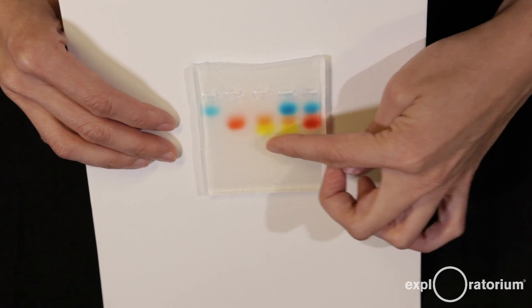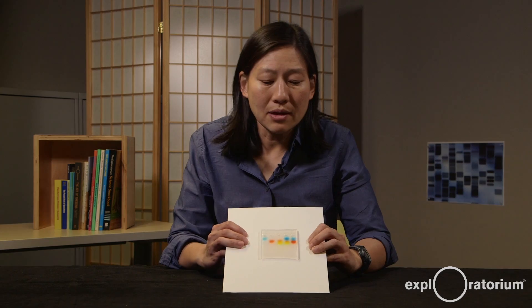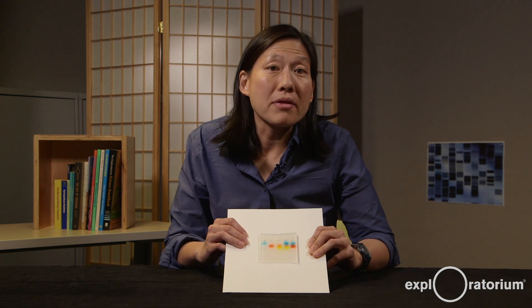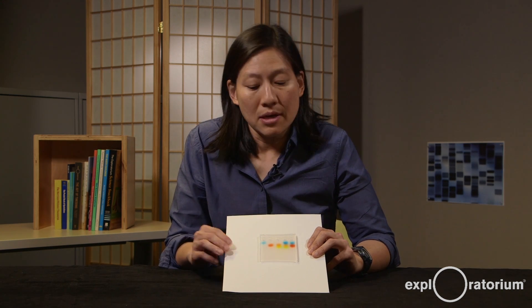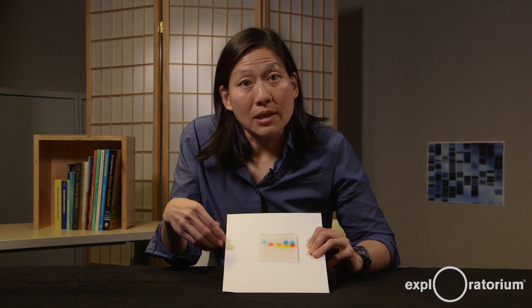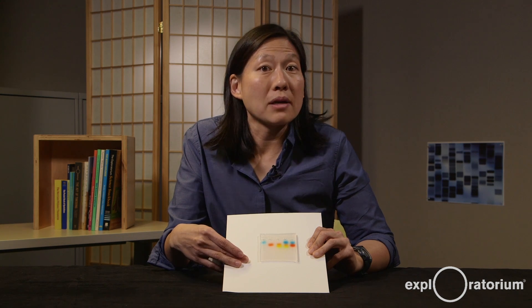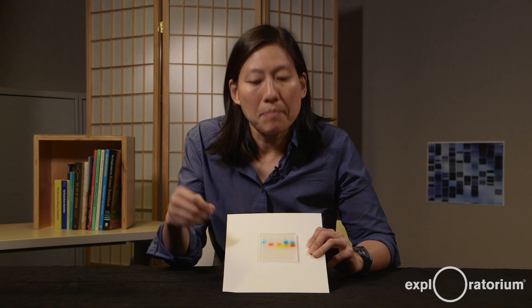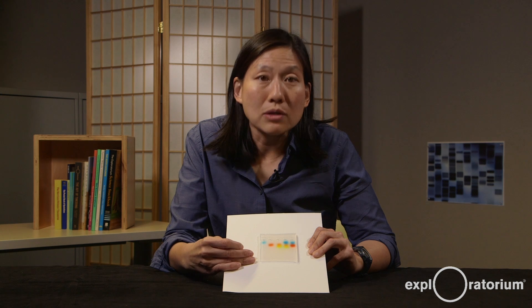The idea of separating molecules based on their charge and size in a gel electrophoresis chamber is actually the method behind DNA fingerprinting. In biotechnology labs, DNA is manipulated this way. DNA molecules are also negatively charged, just like the colored dye molecules, so they migrate towards the positive terminal. The rate at which they migrate depends on their size — so a well filled with different-size DNA fragments will slowly separate, with the smallest ones moving further and the larger ones moving more slowly.